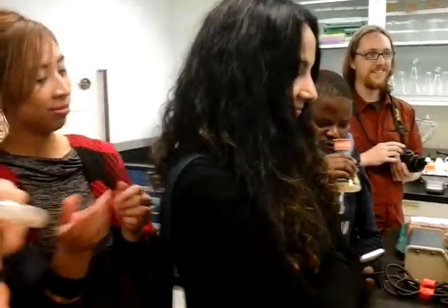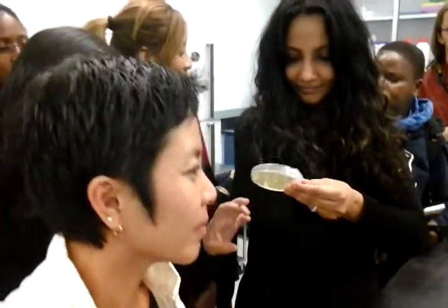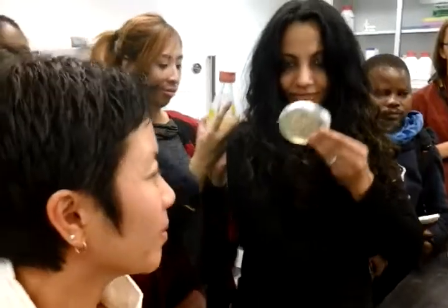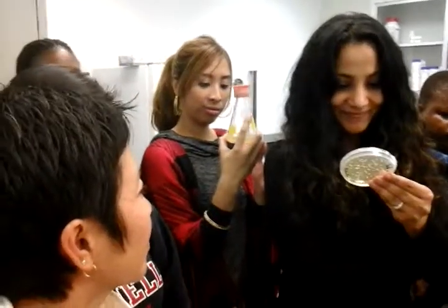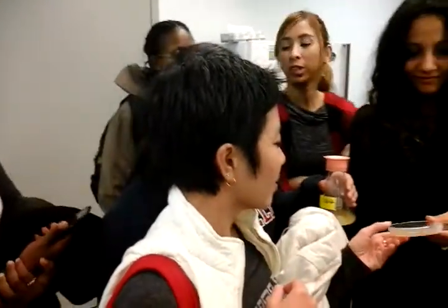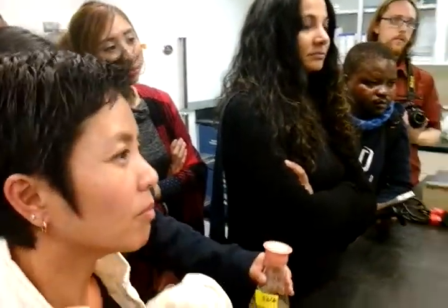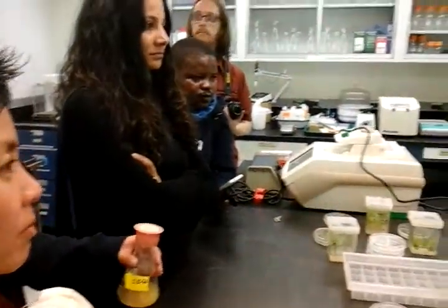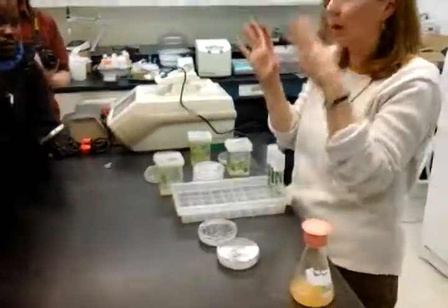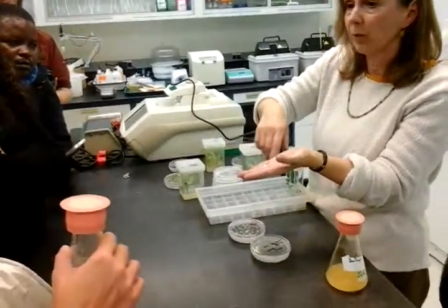How did you electroporate it? How did you open it? Remind me when we go down — I'll show you the machine that we use. The bacteria goes into a little vial, and then we put the plasmid DNA in there, and then it goes into what's called an electroporator. Those are the colonies. I'd be happy to not rush through all this and show you a lot more. We'll take the time and I'll show you what an electroporator is and how we do that.